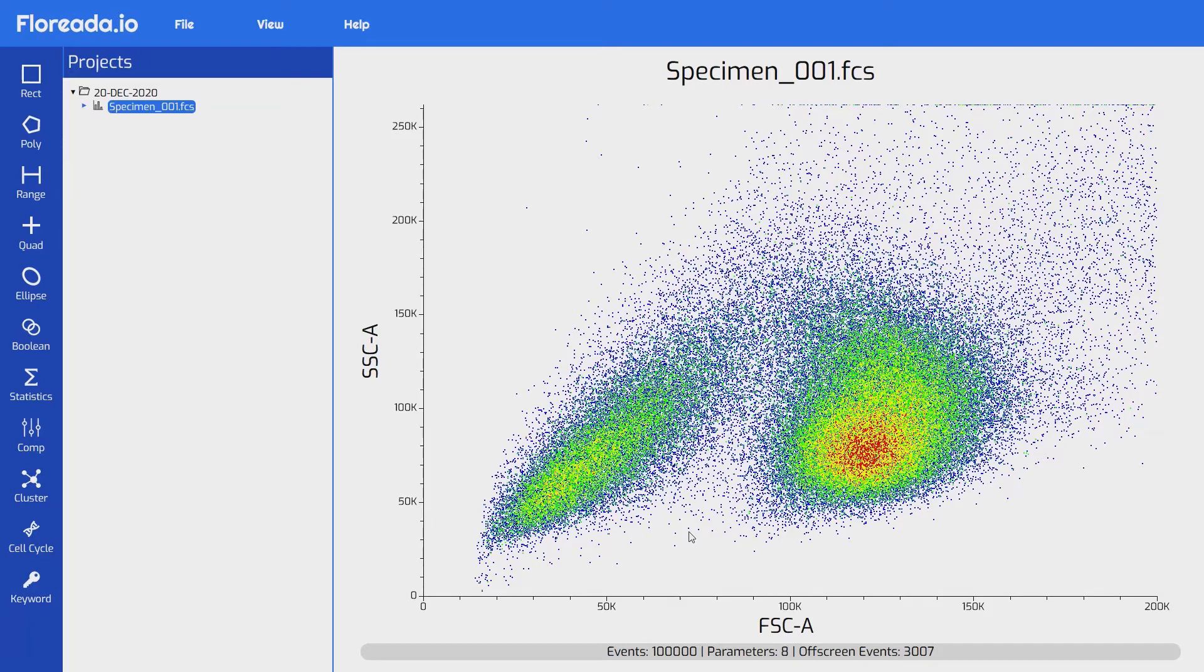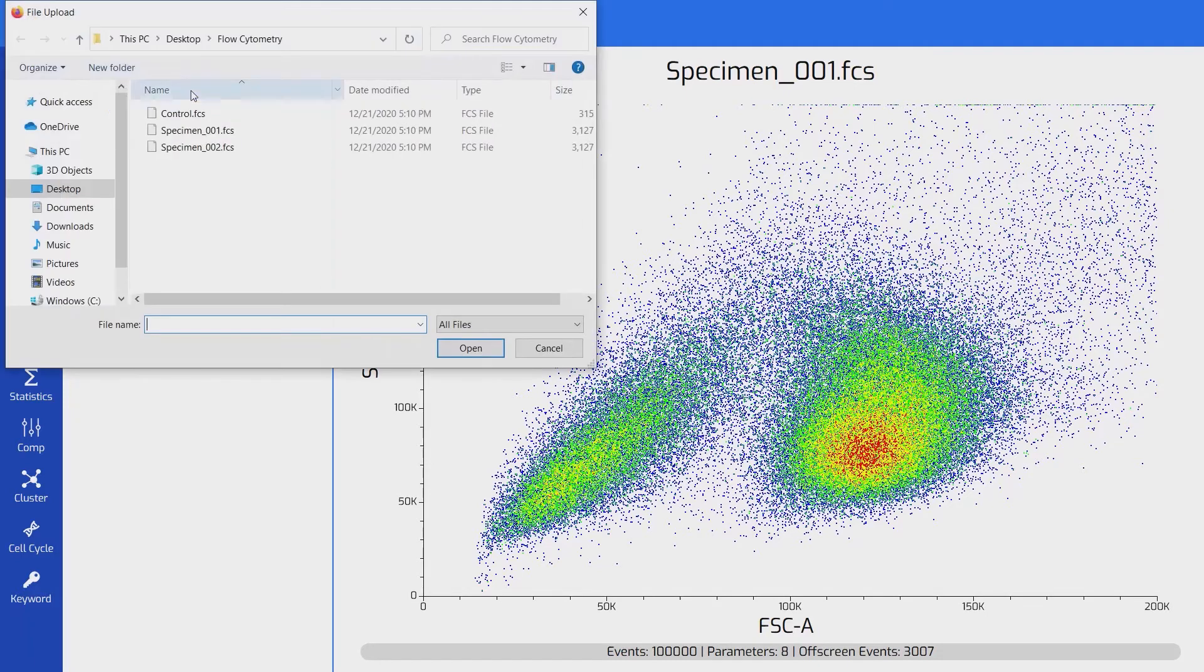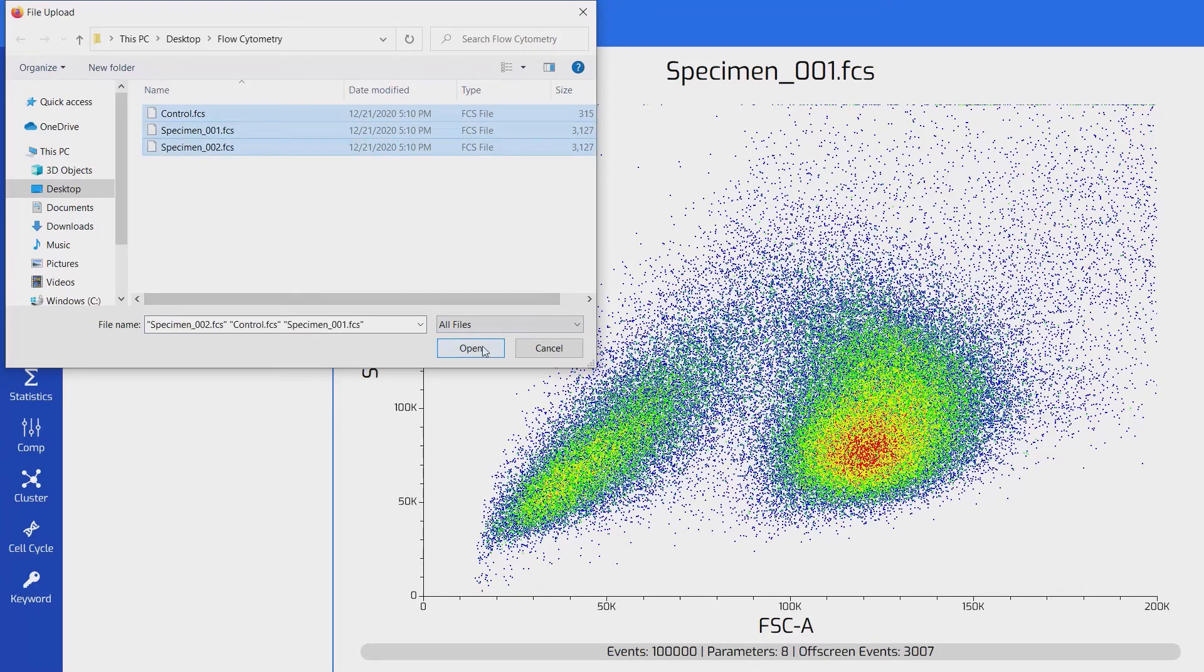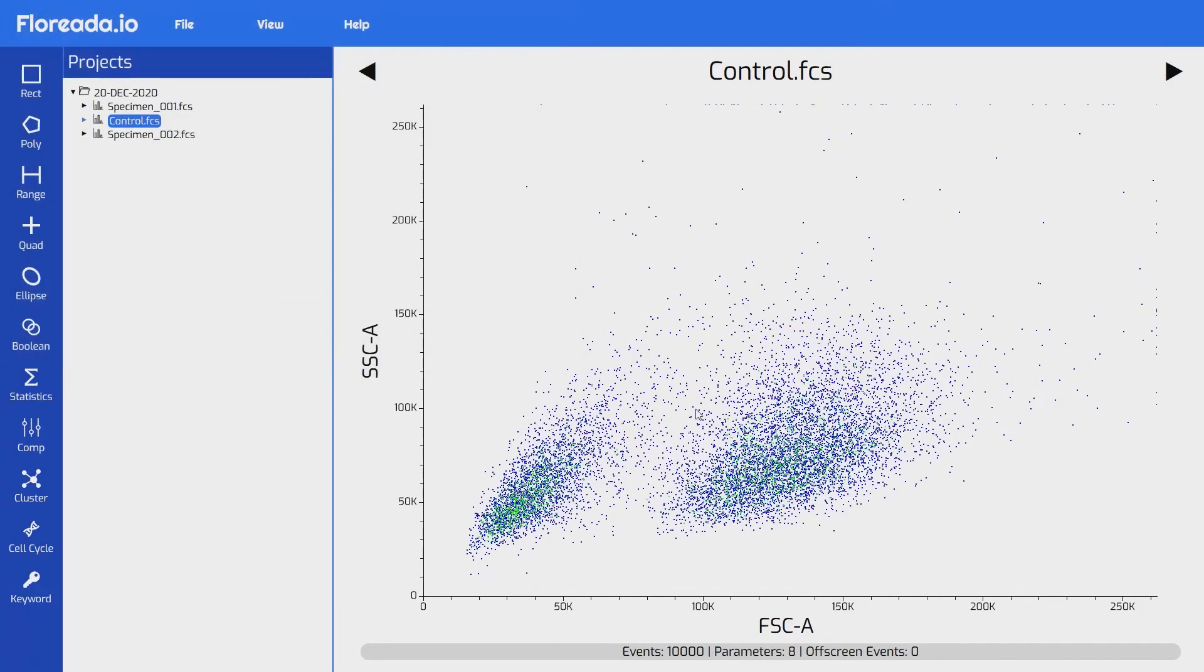Now let's open up some more files. I'm going to select all of these. You can see that all of our files are now opened in the project panel.